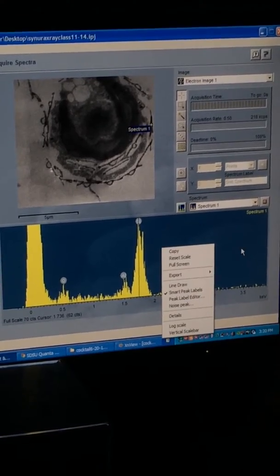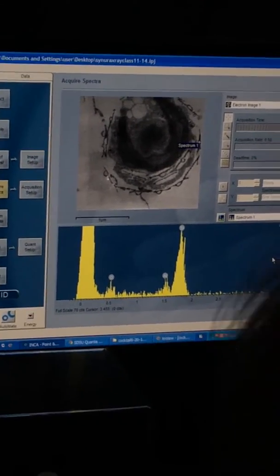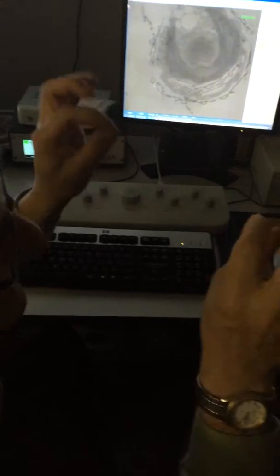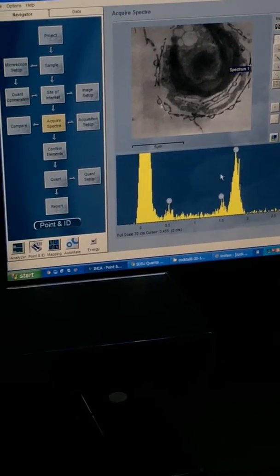And we talked about how images can be very noisy. Like when you are looking on the TEM camera and it's moving around, the image isn't really crisp like it is when you take the picture. So when you're taking your picture, you're taking a multiple scan, averaging them all together to get rid of the snap, crackle, pop. In this case, our snap, crackle, pop in the electronics shows up as this giant peak here.